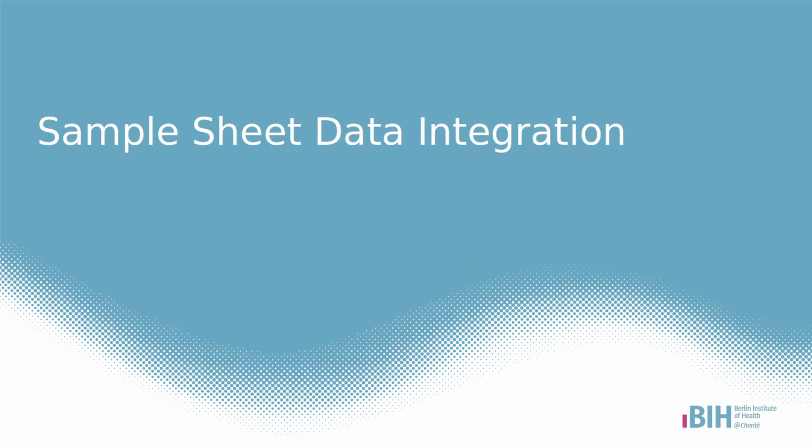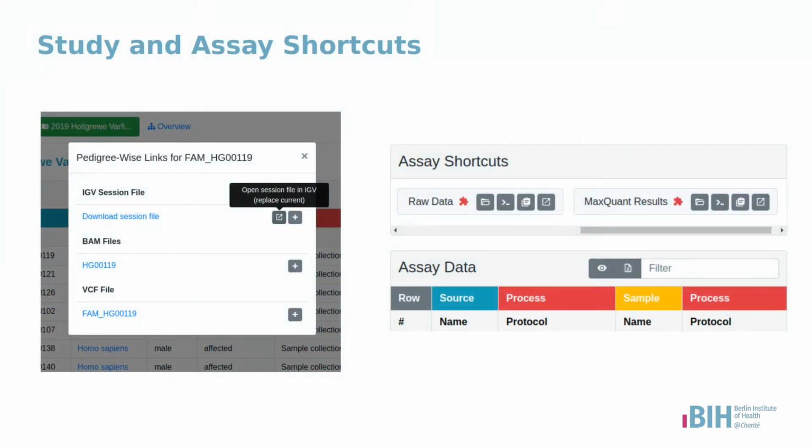SODAR automatically generates shortcuts to relevant study files in iRODS. This includes the most recent BAM and VCF files for germline and cancer studies, as well as raw data and MaxQuant links for proteomics projects.